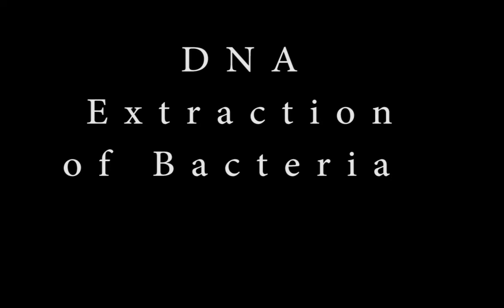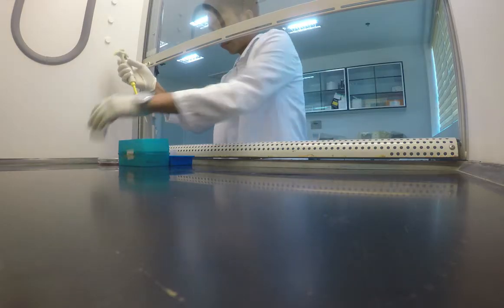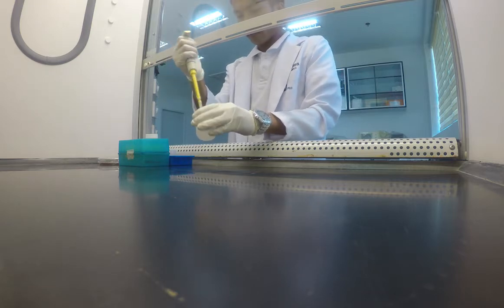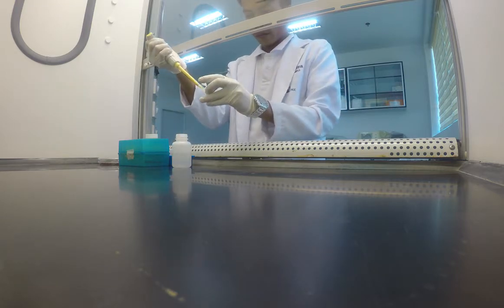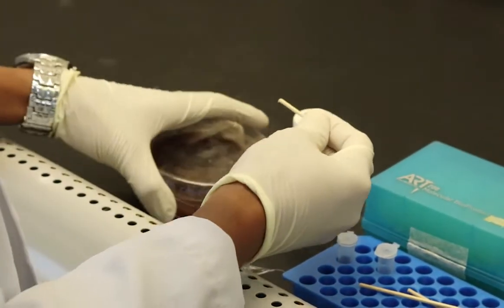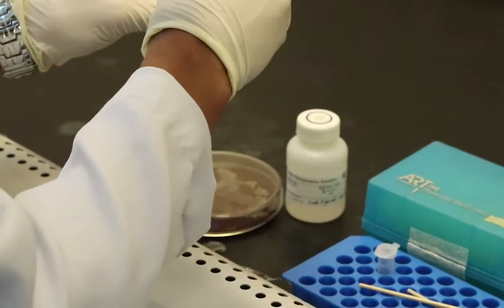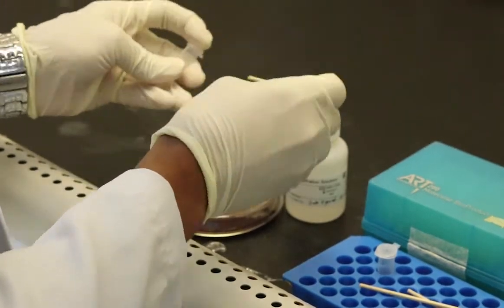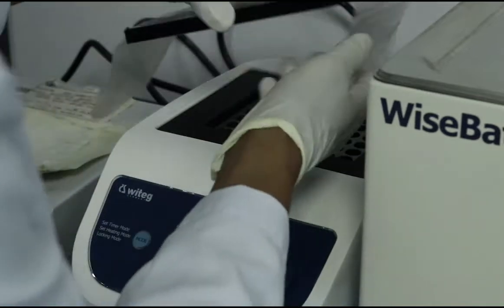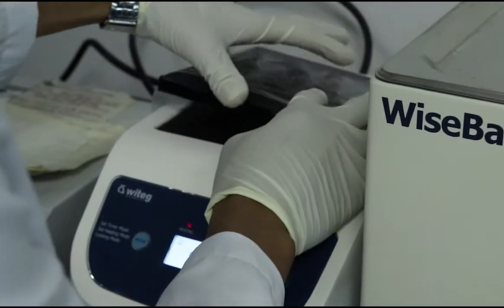Extraction from bacteria. Add 37 microliter of DNA rehydration to a 2 milliliter microcentrifuge tube. From bacteria culture plates, pick the desired colony for extraction. Using sterile cotton swabs or inoculating loop, scrape the desired colony and add to the microcentrifuge tube. Mix. Incubate at 95 degrees Celsius for 10 minutes.